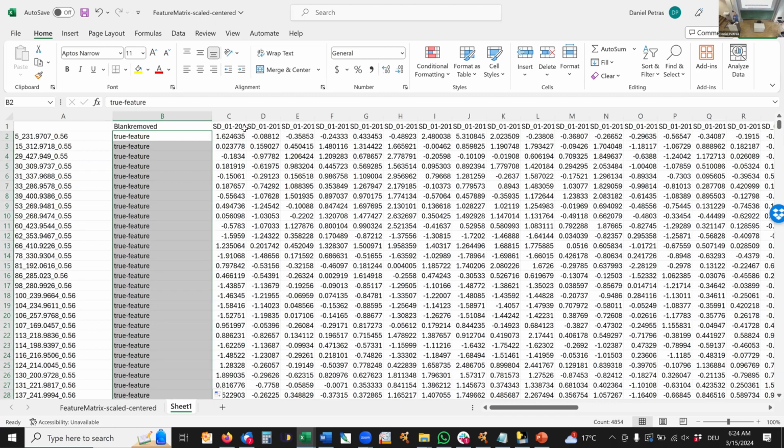And now, as we learned yesterday, it's not very difficult to import this back into Cytoscape. All I need is the feature ID, right? There's only one thing that might be a little bit complicated, but it's not too bad: this feature ID is buried in that string here, because what the app does is combine the feature number with the mass and the retention time.